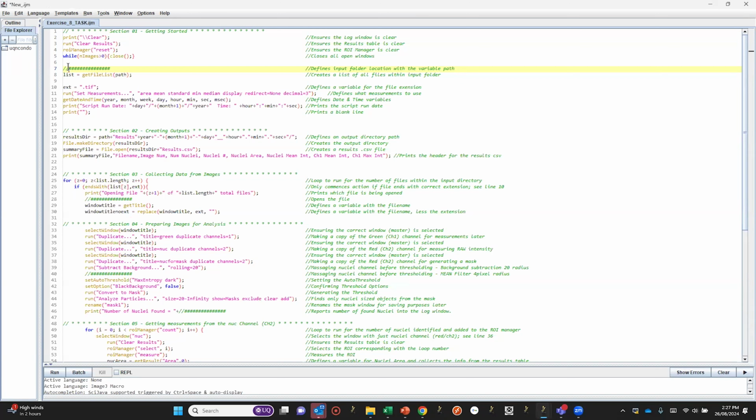You know what that looks like. Open the file. If you haven't got into the other script, then you can pretty much populate these things with whatever is working before. Because as I said, and I'll say again, if you use same commands, you can just copy paste from one code to another, and it should work. But yeah, have a go at that.